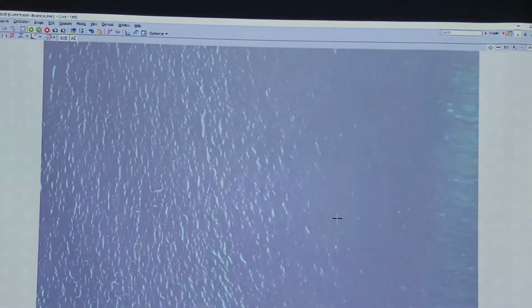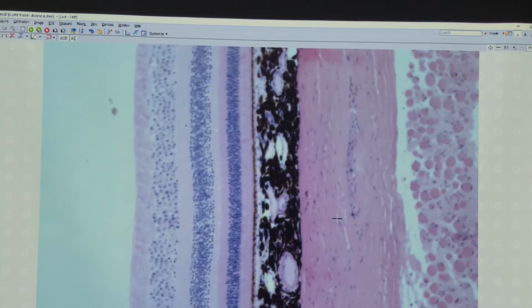Okay, trying to use this micrograph to give you just a little sense of scale. This is the lower or inferior part of the iris. This would be the pupil right here, and this big thing is the lens. Not that you have to know those for your quiz or your practical. I just want you to see where we are in this eye. And then if I simply go backwards, this is all lens. All the way through this is where vitreous humor would be, everyone, behind the lens. And then I keep going, keep going, keep going, until I finally get here to the retina. So this is the retina. Very easy, pretty straightforward, I think.